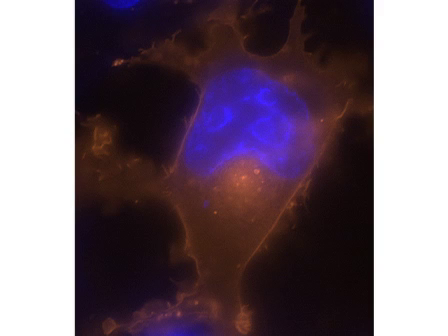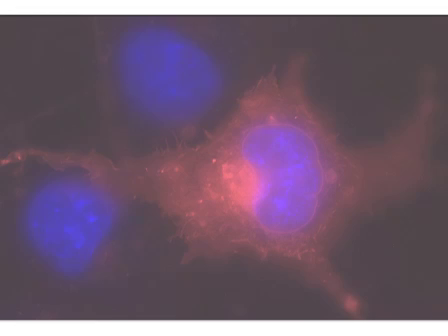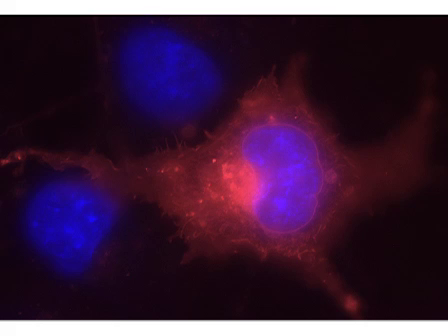The cells were labeled with SNAPCELL TMR-star for 30 minutes and counterstained with Hoechst 33342 for nuclei. The red fluorescence indicates the presence of cell surface receptor protein ADR beta 2, while blue fluorescence identifies the nucleus.